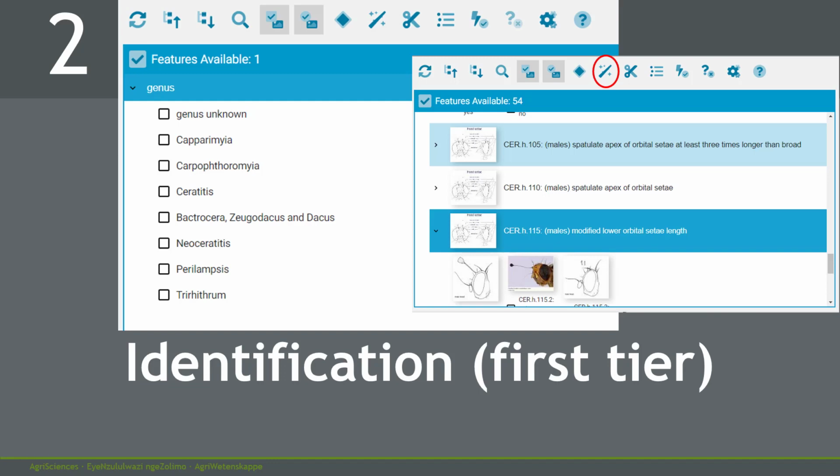When you have finished identifying all individuals in a sample, you can return them all to the same vial if they are all in one species, or if they are different species, only if there are not more than 100 individuals in the sample. Flies are stored individually if they cannot be identified and need to be sent to a specialist. For preservation of flies and shipping protocols, please see the specific webinar which deals with this topic.